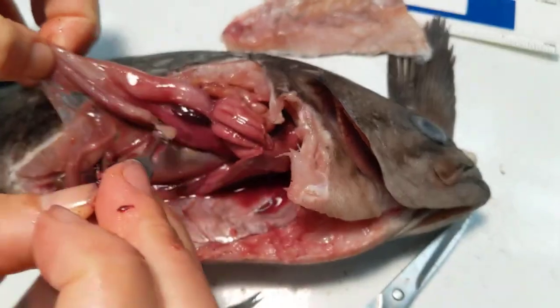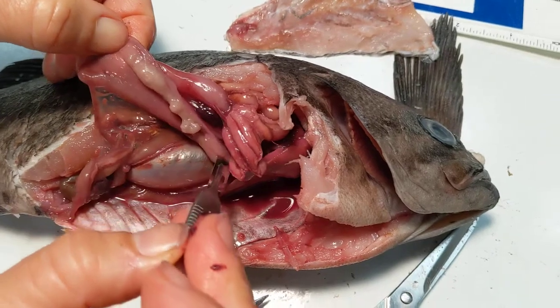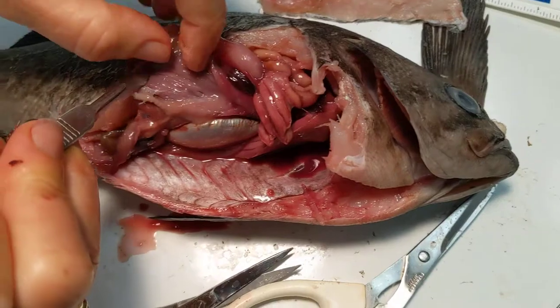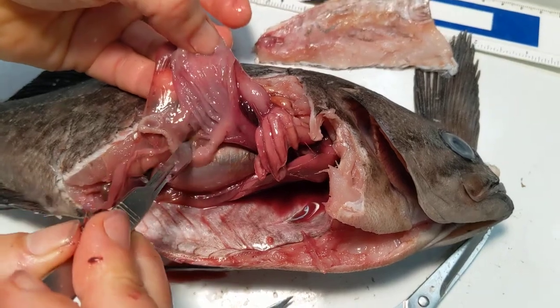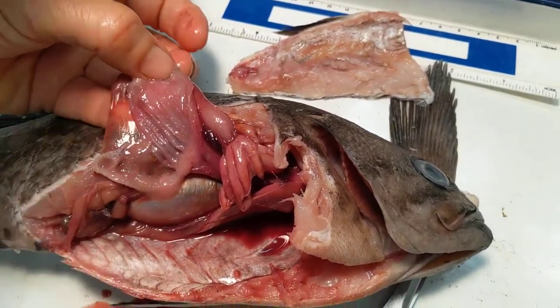It feels pretty empty to me, so this fish might not have enjoyed a last meal. We just see some digested matter. But one of the things that you can see, perhaps, is those folds in the stomach — so increasing surface area, lots of digestive juices out there.